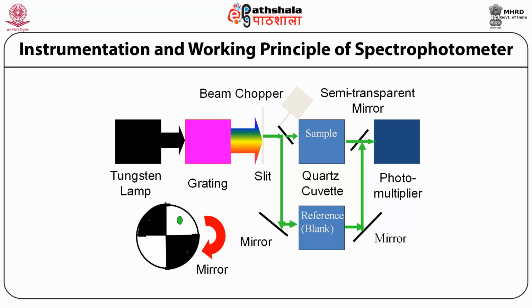Visible light is normally supplied by a tungsten lamp, or in modern systems by tungsten halogen, also described as a quartz iodine lamp, which has higher relative output in the crossover region of 320 to 380 nanometer. The long wavelength limit is usually the cutoff of the glass or quartz envelope, normally well beyond the useful visible limit of 900 nanometer. Wavelength selectors, which is the monochromator.